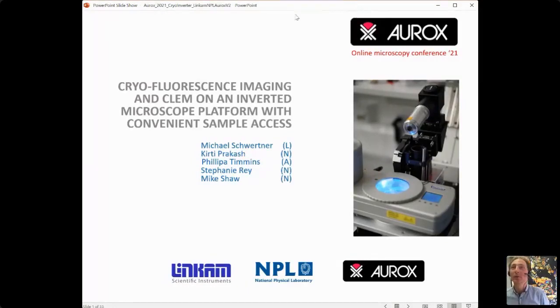So we will talk about a practical topic: how to integrate the cryo system into your existing setups and how to make the workflow smoother.